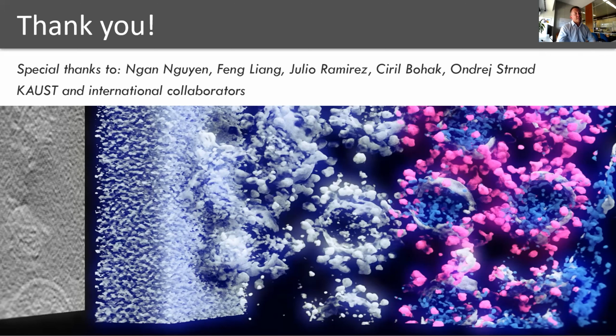This error should, for example, be in some sense very uniform across the volume, and should not be very dependent on the specimen versus background location. Of course, it is a little bit, because the noise is directly dependent on the specimen, but there should not be very strong variations of this error term. And if that's the case, then you can be quite satisfied with the denoising approach.